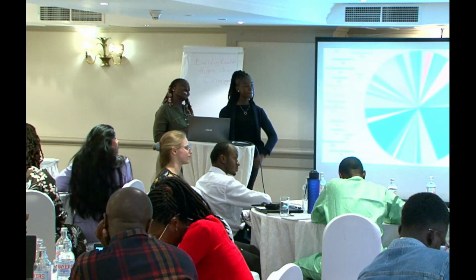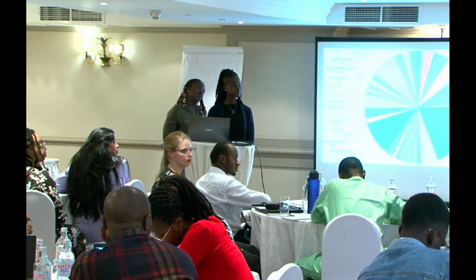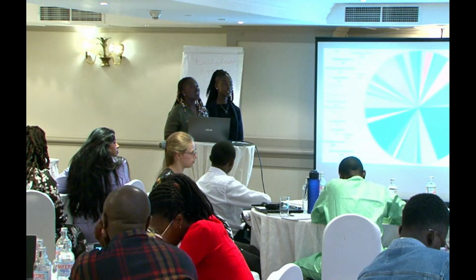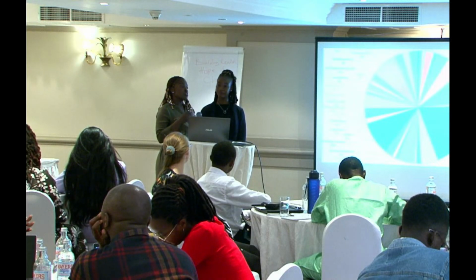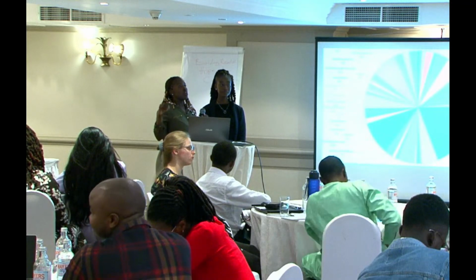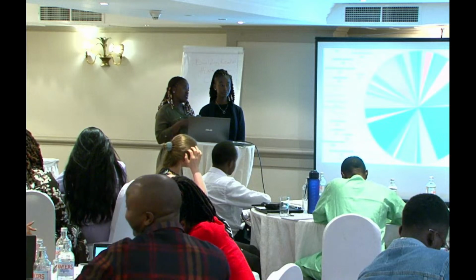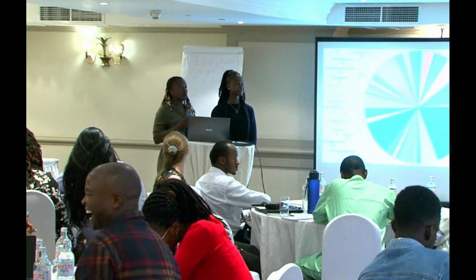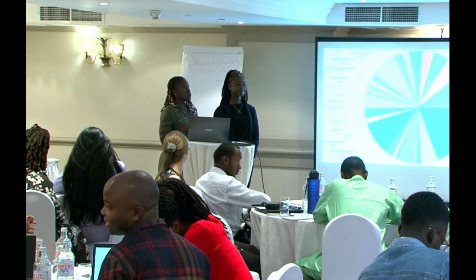Thank you for the nice presentation. Did you test your products, the market products, with all the methods that you used, the LCMS, GCMS, and so on? No, ma'am. Again, we were not able to actually even extract our plant from the field work that was done, and the commercial products were provided for us only at the time we did the HPTLC analysis. That's the part we were talking about, where we made the error of over-diluting the actual sample.